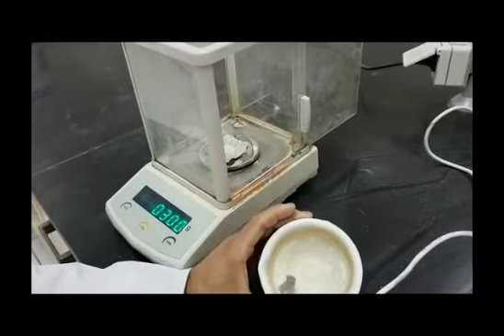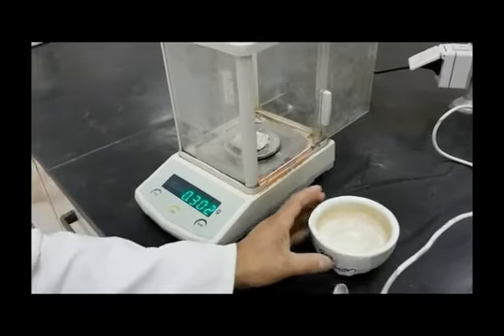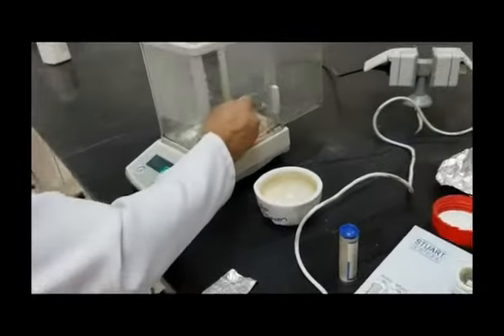To do so, measure 300 milligrams of the prepared salt, sodium mefenamate.